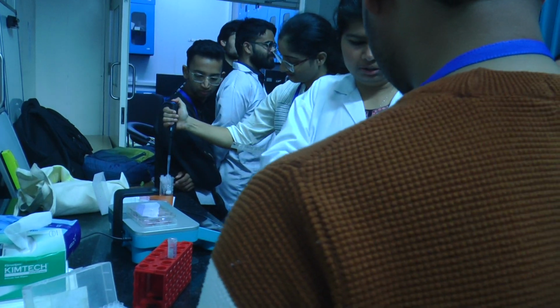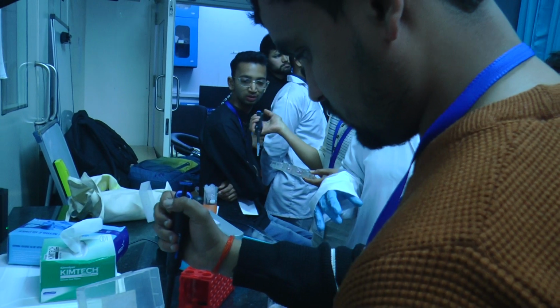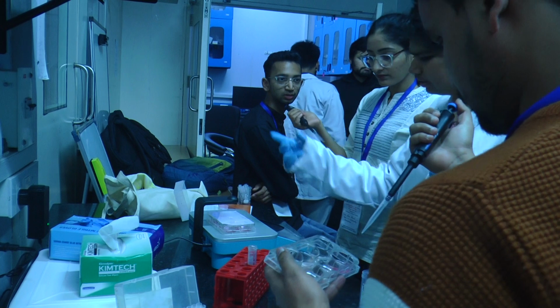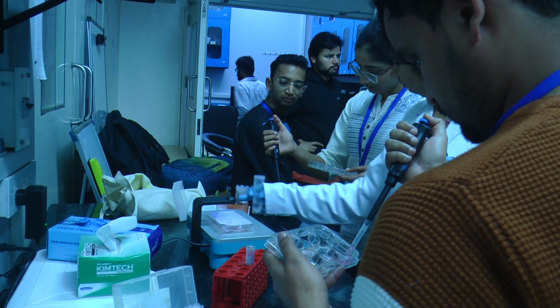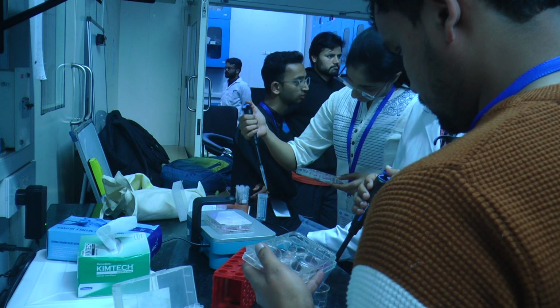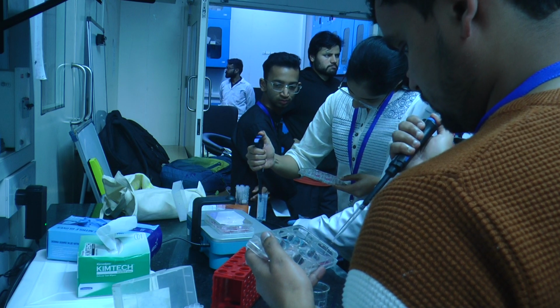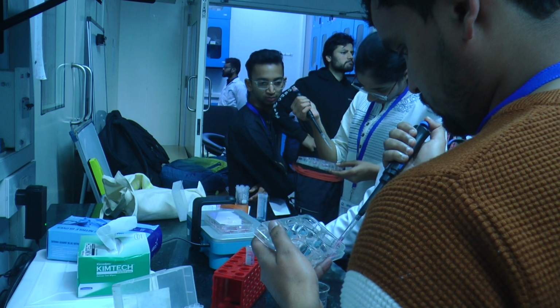There have to be aqueous solution inside and outside. So that is why we form a whole vesicle. We have sucrose inside, outside also we have sucrose. Now we are adding glucose from outside. We'll add that amount so that we assume outside only glucose is left. Sucrose is diluted to a large amount.